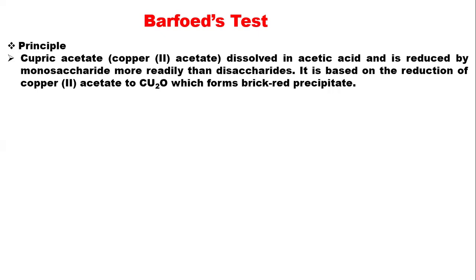So for Barfoed's test, instead of the reagent being alkaline, the reaction here takes place in a weakly, slightly acidic medium.